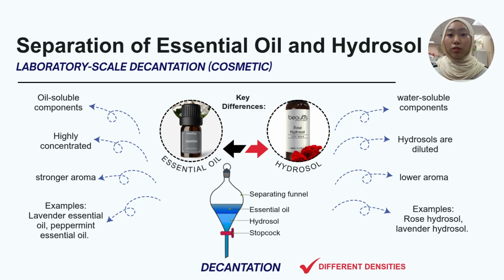Decantation is a separation process that involves carefully pouring off a liquid from a liquid-liquid or liquid-solid mixture after the denser one has settled to the bottom. It's a simple method that relies on gravity.